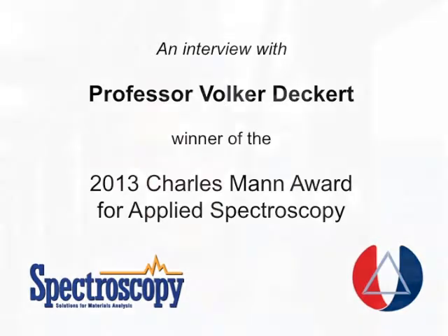So you're well known for your work on tip-enhanced Raman spectroscopy, or TERS. Could you briefly describe this technique and how it is different from SERS?